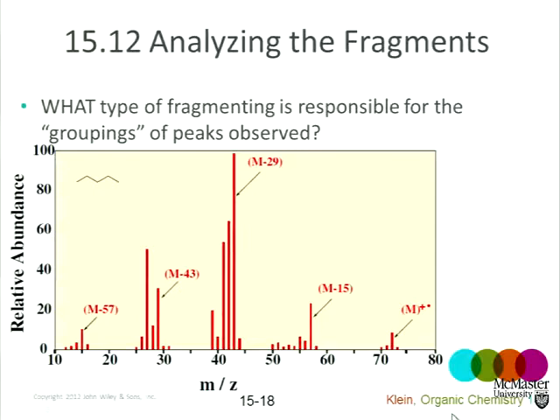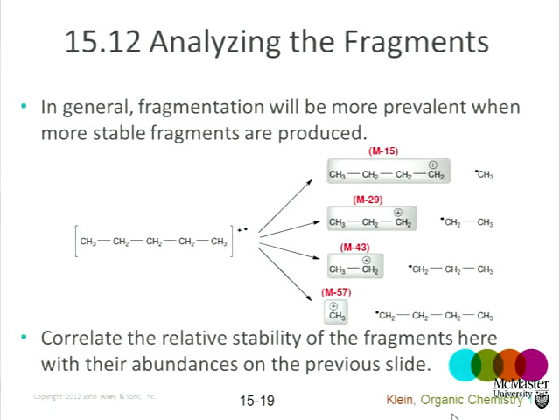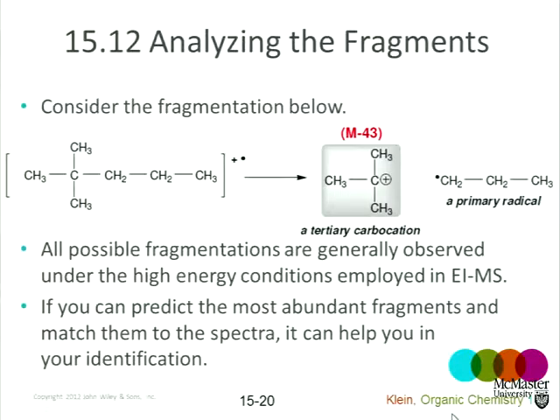So you are not expected to learn a lot about fragmentation in this course. The main purpose, as I say, is that mass spectrometry gives you the molecular weight of the compound, but there is a lot more information in a spectrum.